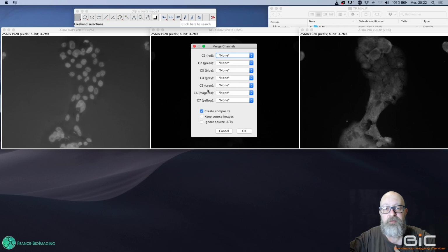You also see that you've got 4 additional possible colors: gray, cyan, magenta, and yellow. Cyan, magenta, and yellow are used especially for colorblind people. It will be easier to see cyan, magenta, and yellow as compared to pure blue, red, and green, especially if you're lacking the detectors in your eye for one of the channels.